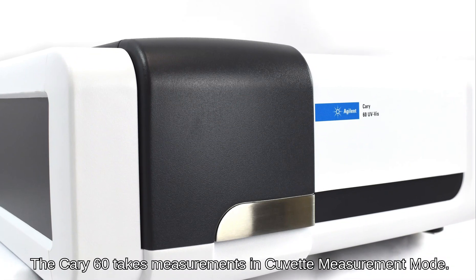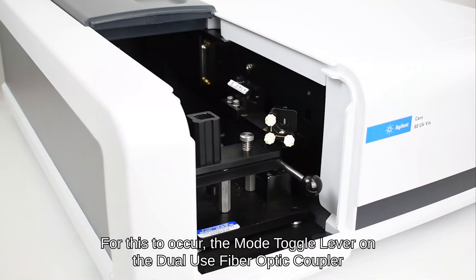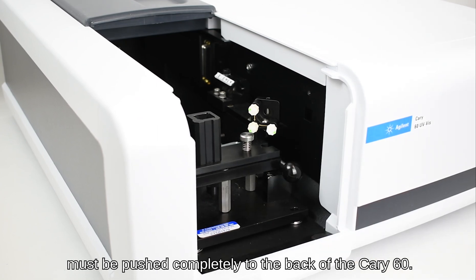The Cary 60 takes measurements in cuvette measurement mode. For this to occur, the mode toggle lever on the dual-use fiber optic coupler must be pushed completely to the back of the Cary 60.